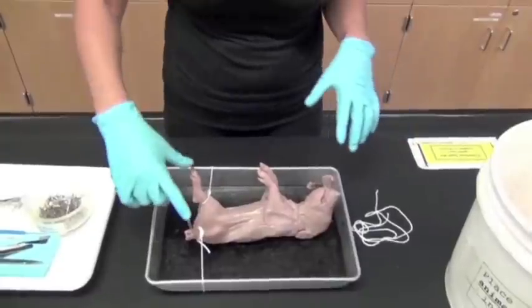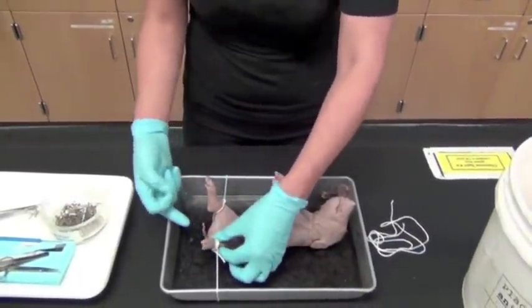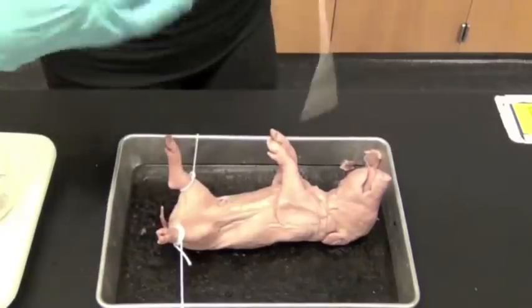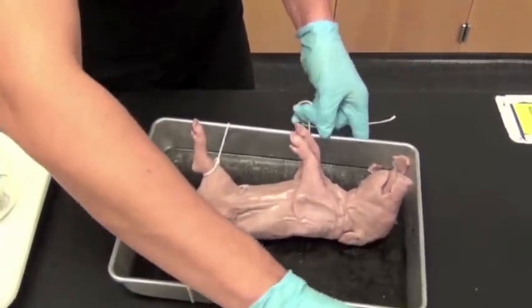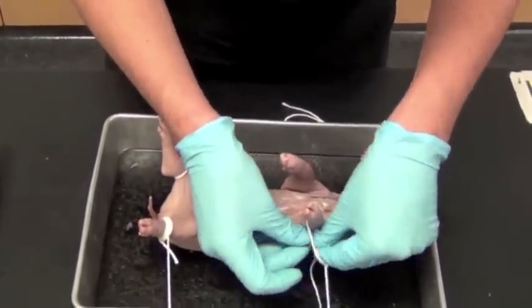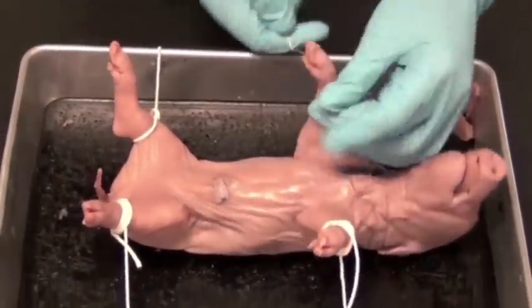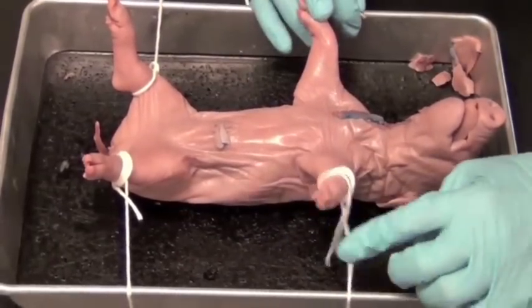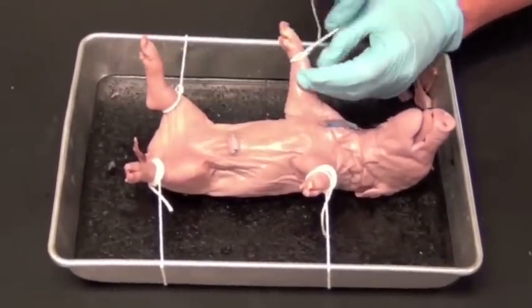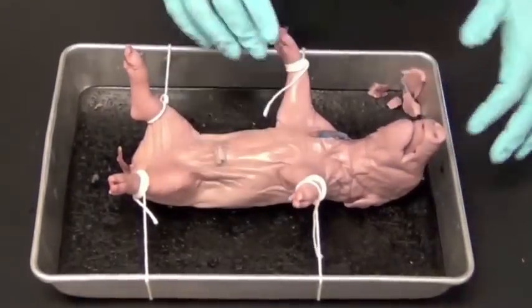Now tie up your pig. Wrap the string under the tray and back around to the other leg, tying just above the knee. Tie a knot on one side and wrap around the other. Pull the string taut — you don't want slack. The whole point of tying the pig is to keep it nice and open so you can work without interruption. Never throw away the string.